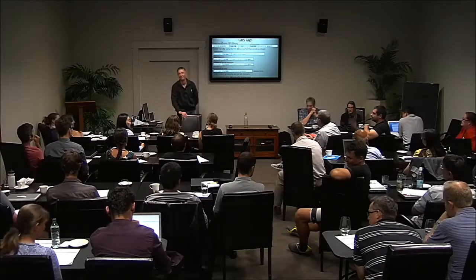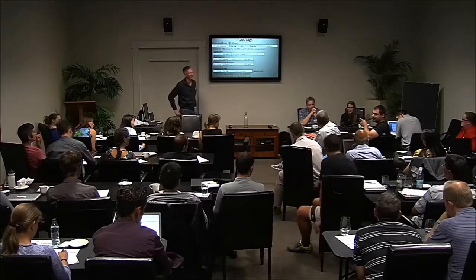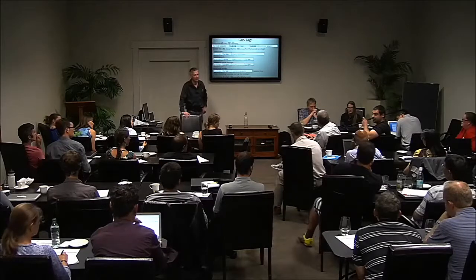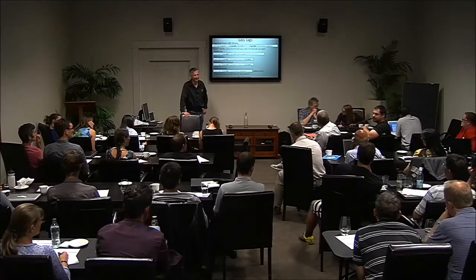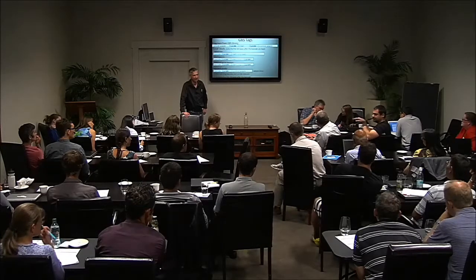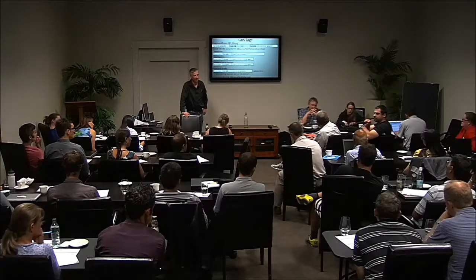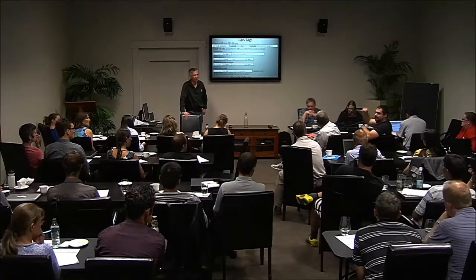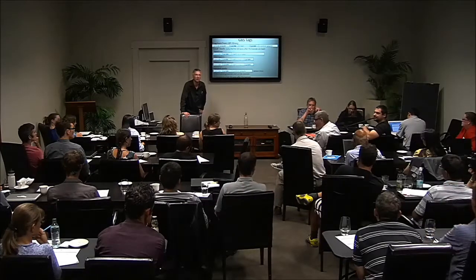Okay. There you go. I was going to say something else. This is very similar to the design of the k-mer size that you need for assembly. And it varies by species. So if you grab a couple of the available genomes and map next generation sequencing data using different k-mers, you'll see that the change from very, very short k-mers mapping everywhere to suddenly becoming unique as you go with longer k-mers is actually very quick, and it varies by species. So you can actually determine that pretty easily.